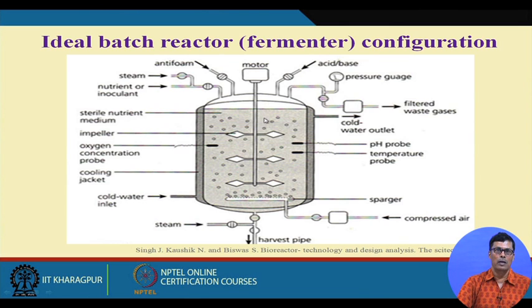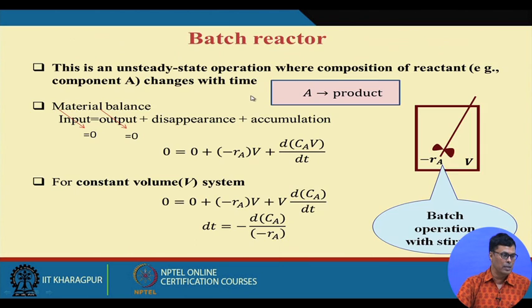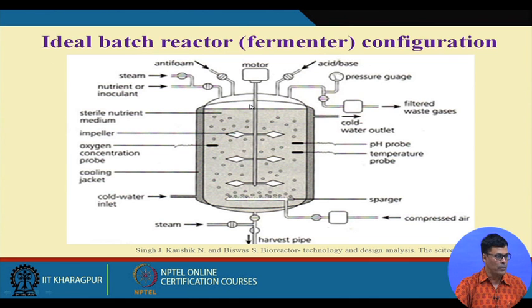So it should be perfectly airtight, and to make it perfectly airtight, the air seal is designed. If you allow the foam to grow, it will enter into the mechanical seal, and as soon as it enters, the seal will be ruptured and contamination will take place.